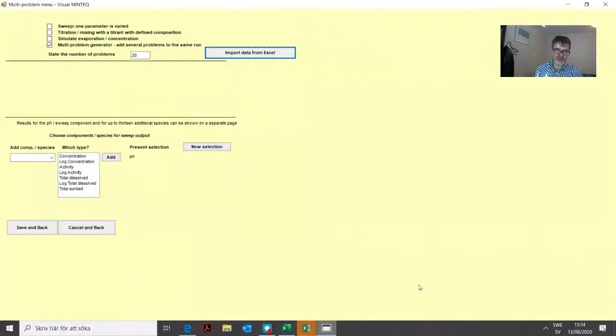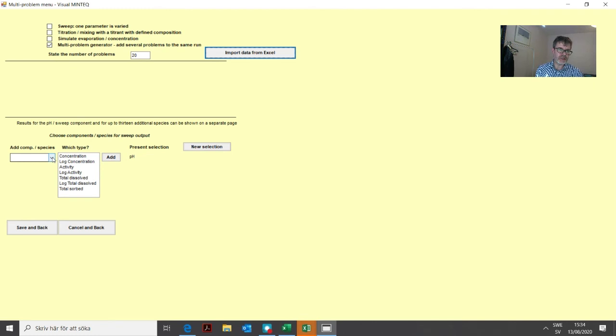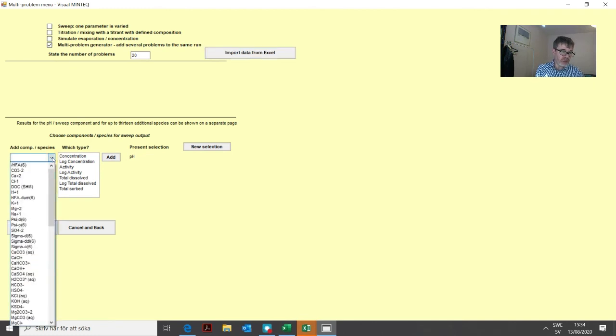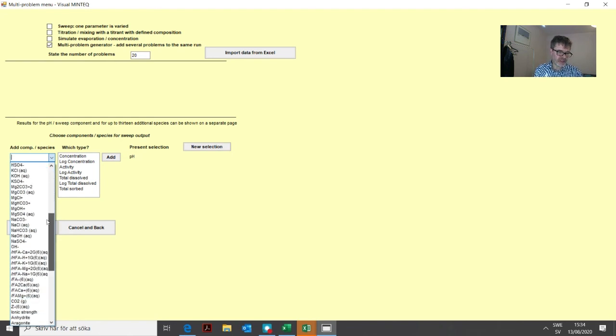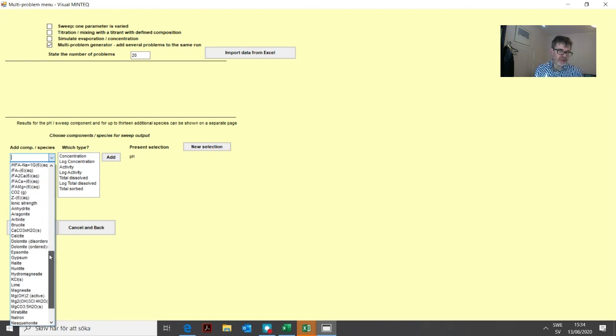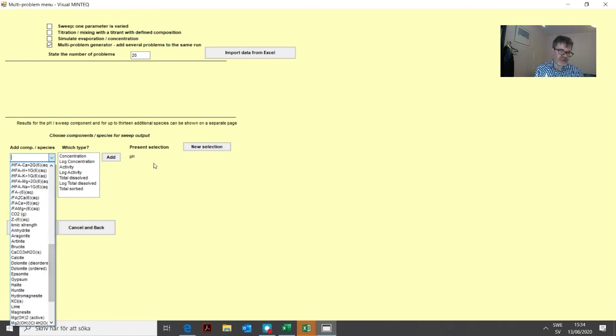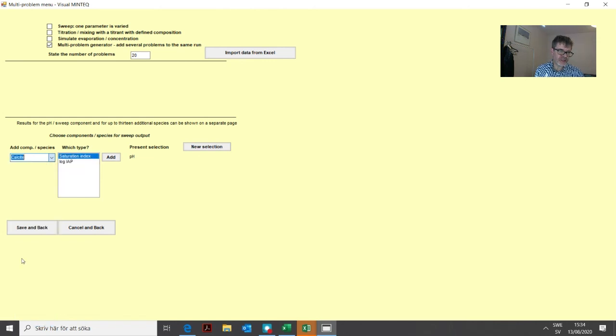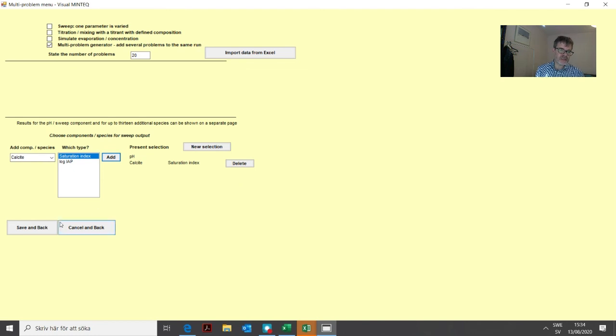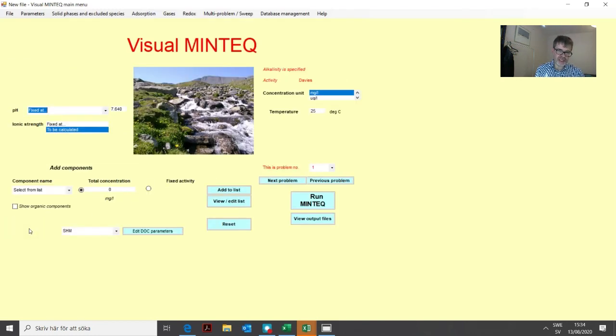We get back to this menu where we can define what we're interested in looking at in the output. The saturation index of calcite would be interesting to look at, so we find calcite in the list and the saturation index, and just add that. Then we click save and back.